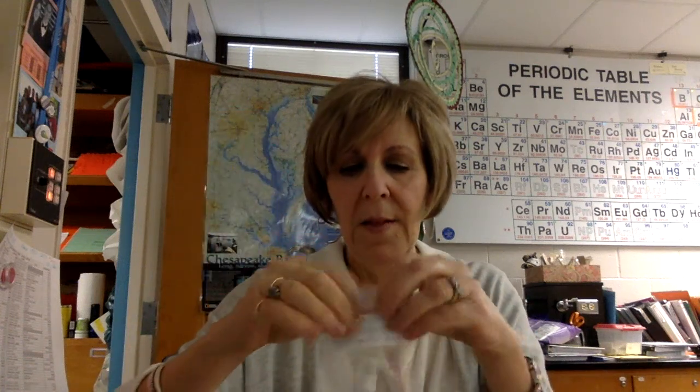You're going to make sure that the test strip that you used, you can throw away, but there should be other ones in here unless you're in period 10. That goes back with the blood. And then everything goes back in this bag, and you're ready for the next class.